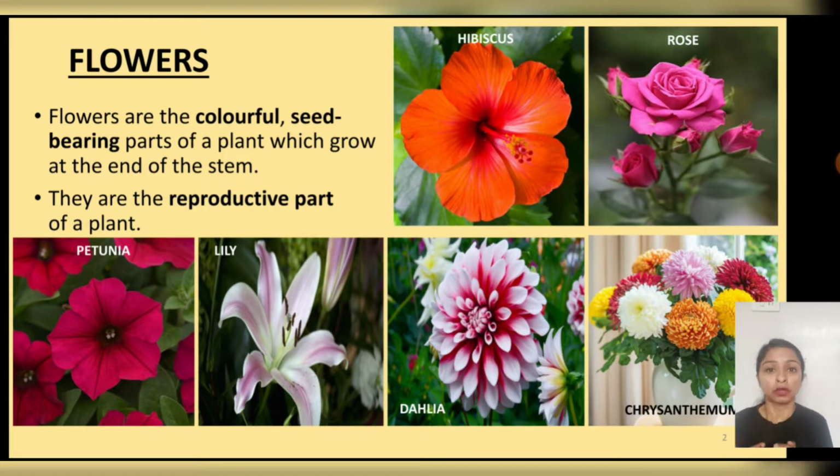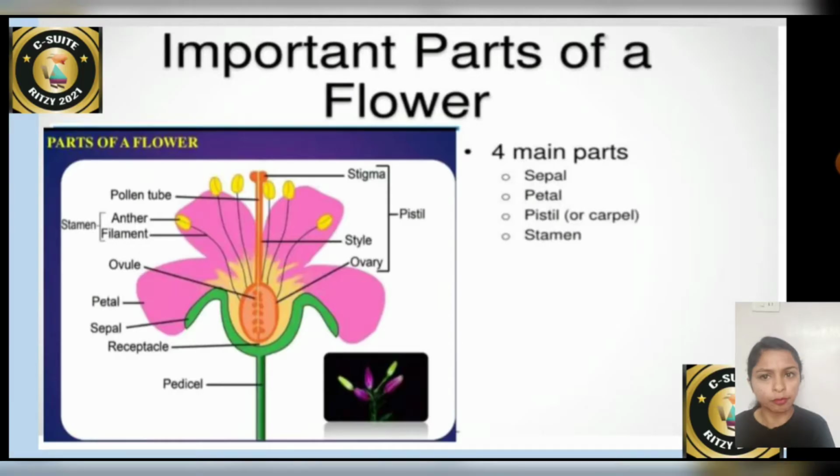This is biology, and it is incomplete without practical work. So we are going to dissect the flower, and then you will come to know each and every part in detail. Before that, we will just take the important parts. Like your sepals, petals and stamens are the most important parts of the flower. We are going to see them in real in the dissection video also.